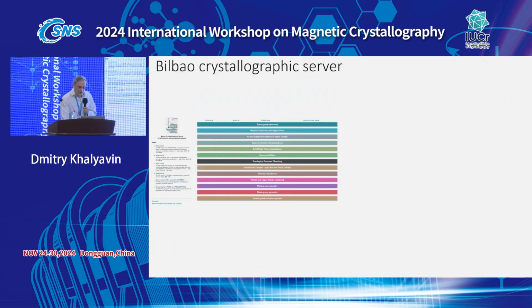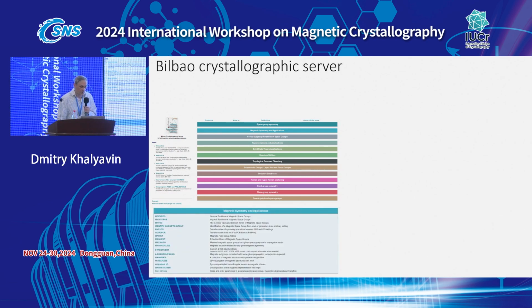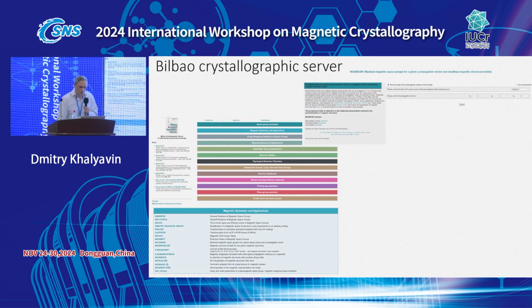That is practical advice. So finally, as I said, today we will be trying to refine magnetic structure using magnetic space groups. So we will use Bilbao tools, which you already know how to use. In particular, we will use a tool called max-magn, which generates maximal isotropy subgroups.